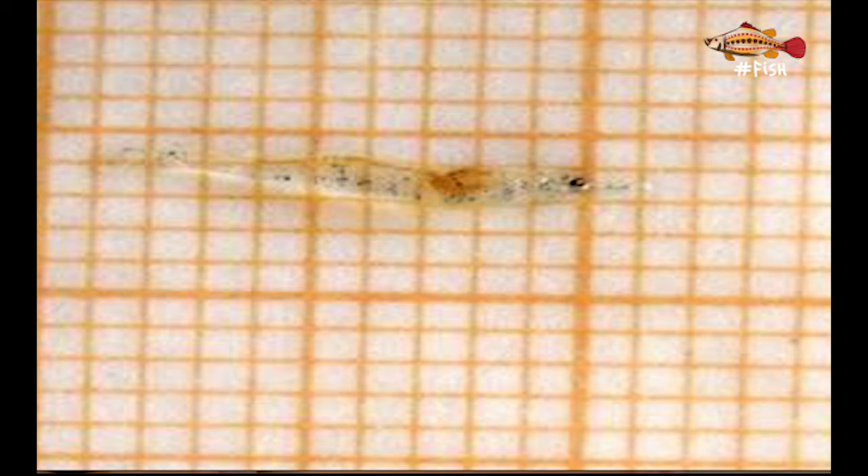After PLs are counted they should be measured. This can be done while waiting for the 30 minutes of recovery from the previous test. Using a simple ruler or a laminated millimetric paper, we measure how many millimeters each PL measures. This test shows not only if they are too small for their age, but also if there are too many variable sizes within the same batch.